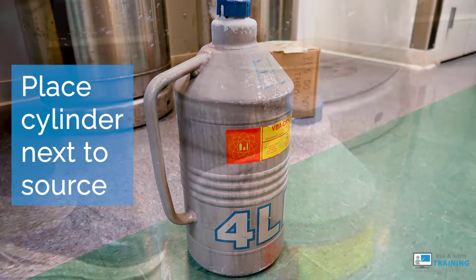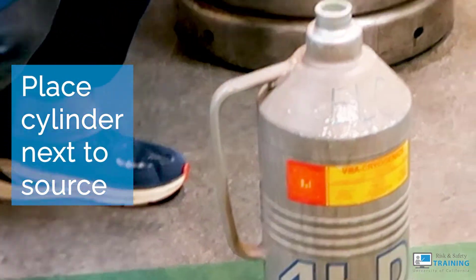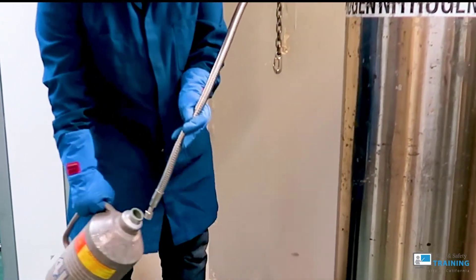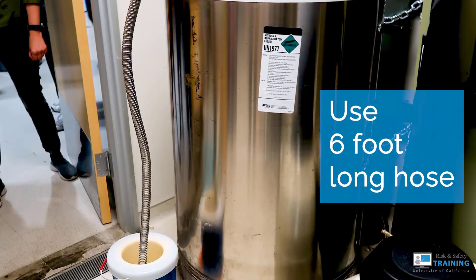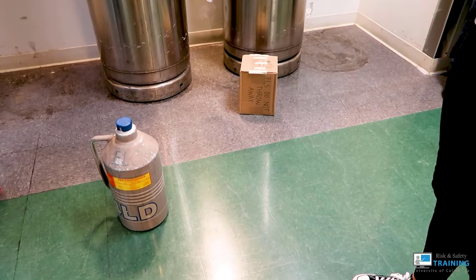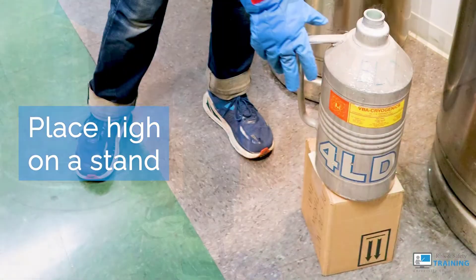Begin by placing the smaller cylinder next to your liquid nitrogen source. Use a transfer line or hose appropriate to the size of the larger tank. The hose should be at least 6 feet long and should reach down to the bottom of your smaller cylinder. Otherwise, use a stand or object to place your smaller dewar higher to reach the hose.